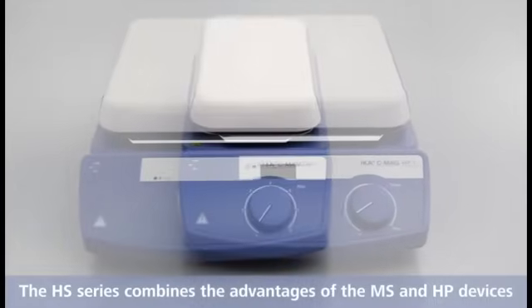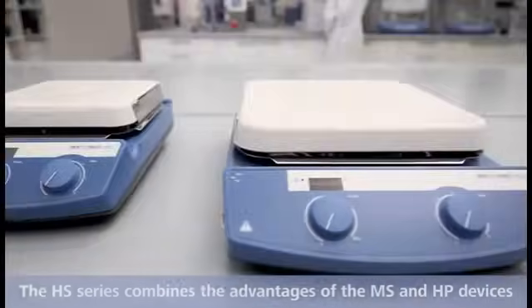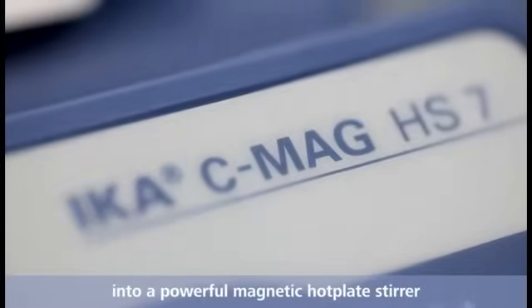The HS series combines the advantages of the MS and HP devices into a powerful magnetic hot plate stirrer.